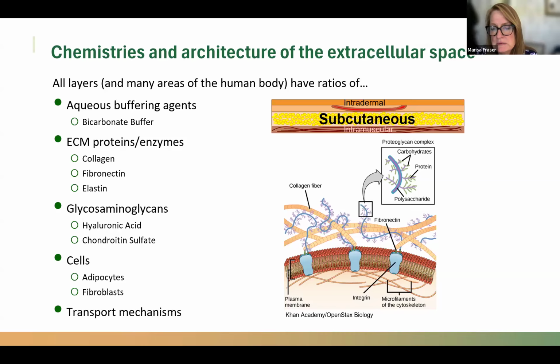Okay, thank you. Next question. The artificial extracellular matrix simulates the subcutaneous tissue, which can be considered a complex structure present in the cartridge, while the outer chamber represents the interstitial fluid that exists between the cells in the subcu tissue. Is this correct? That is a reasonably good generalization.